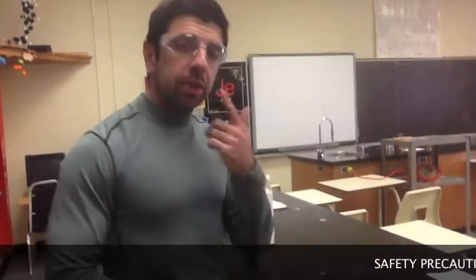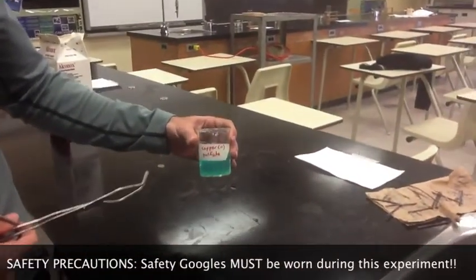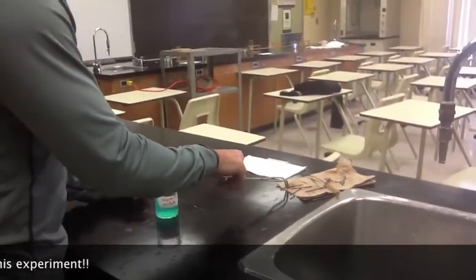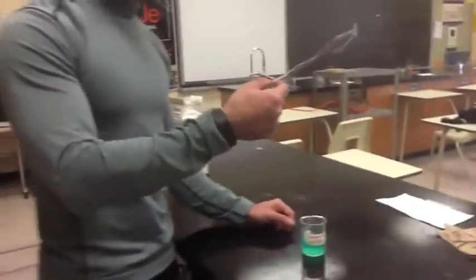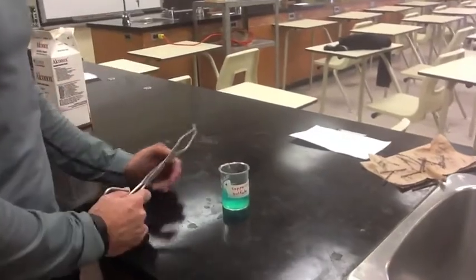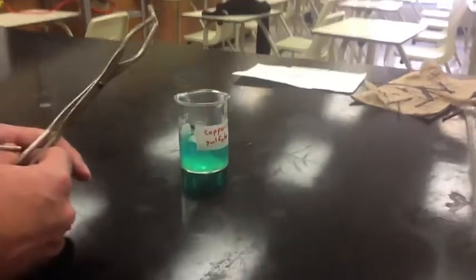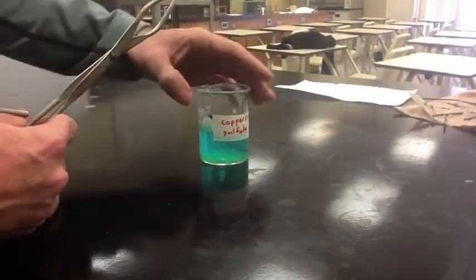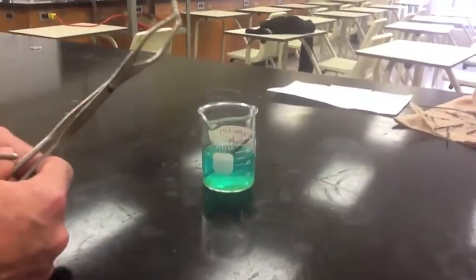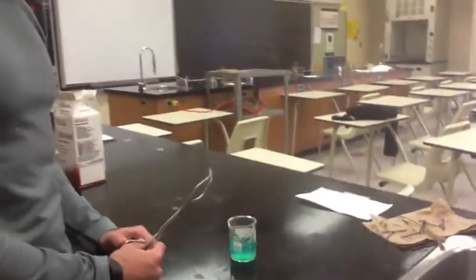Station here, again, goggles are a must. What we have here is copper 2 sulfate and iron nails. So all you're going to do with this station is grab one of the clean iron nails and dip it into the beaker of copper 2 sulfate. Let it sit for a while, make your observations, and identify what type of reaction has taken place, how do you know that a reaction has taken place, and write out a balanced chemical equation.